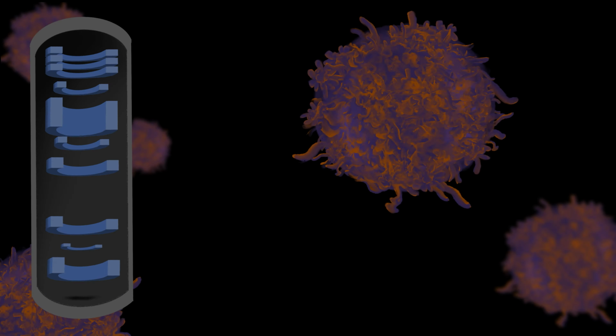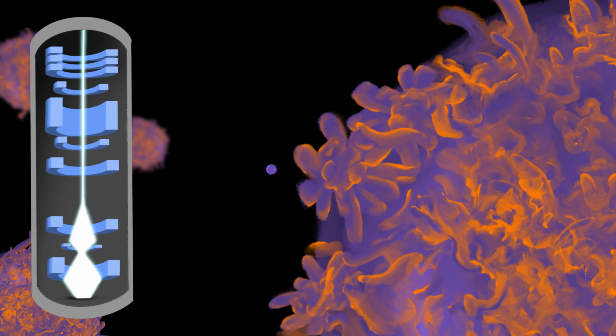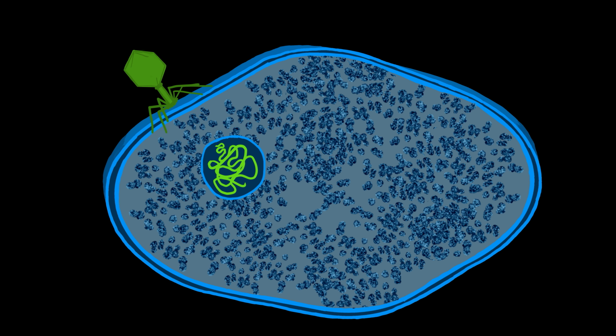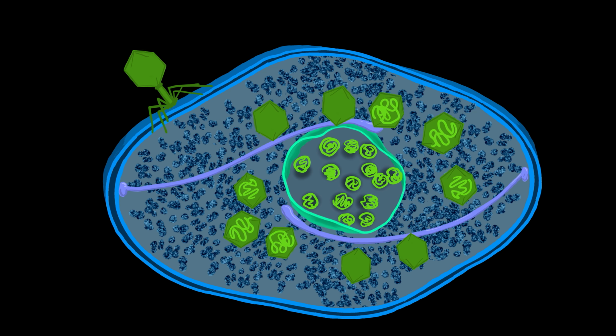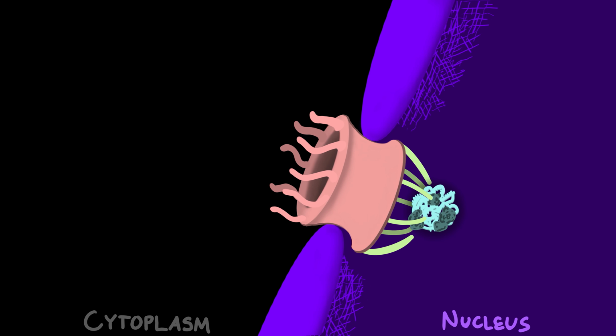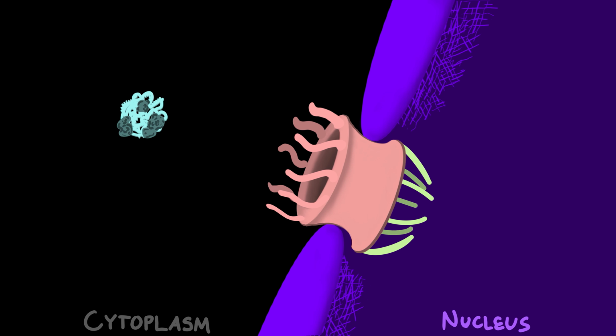With such a powerful observation tool, our lab is able to investigate not only HIV, but many other biological questions. We study how certain phage-infected bacteria can have sophisticated cellular biology similar to eukaryotes, such as cytoskeletal filaments and a nucleus. We aim to discover the ultrastructure within tunneling nanotubes, an understudied cell-to-cell mode of communication. We want to visualize and understand structure of the nuclear pore complex, which transports materials between the nucleus and cytoplasm.